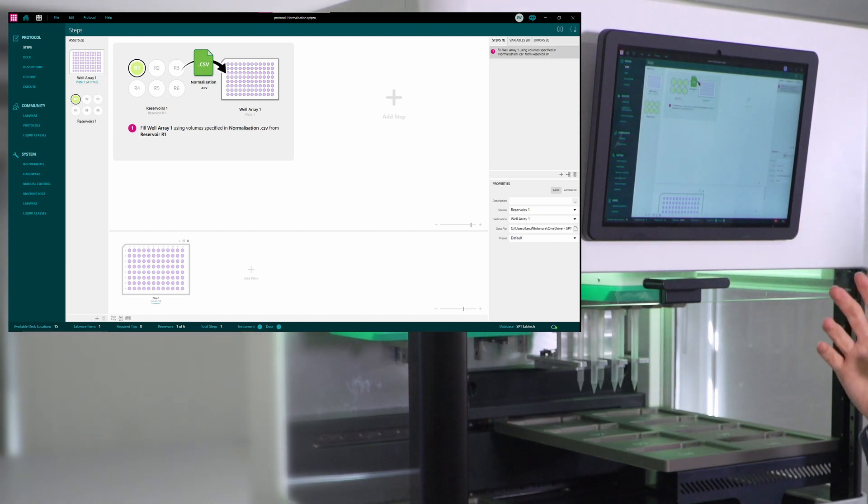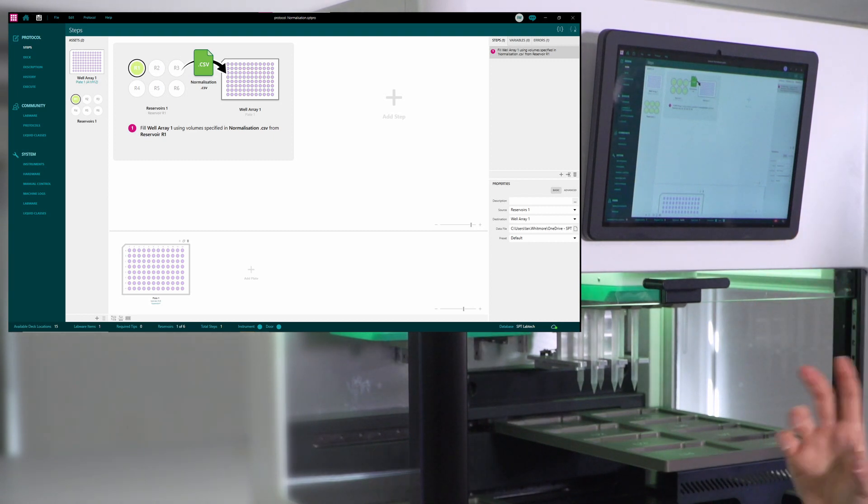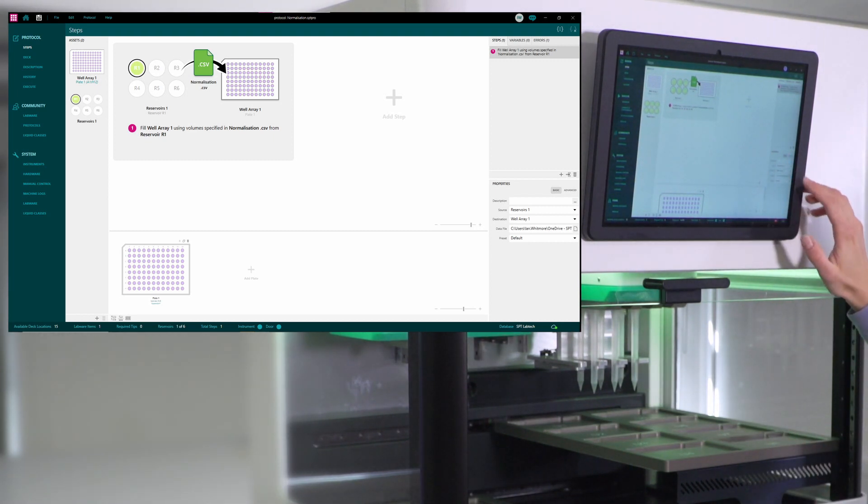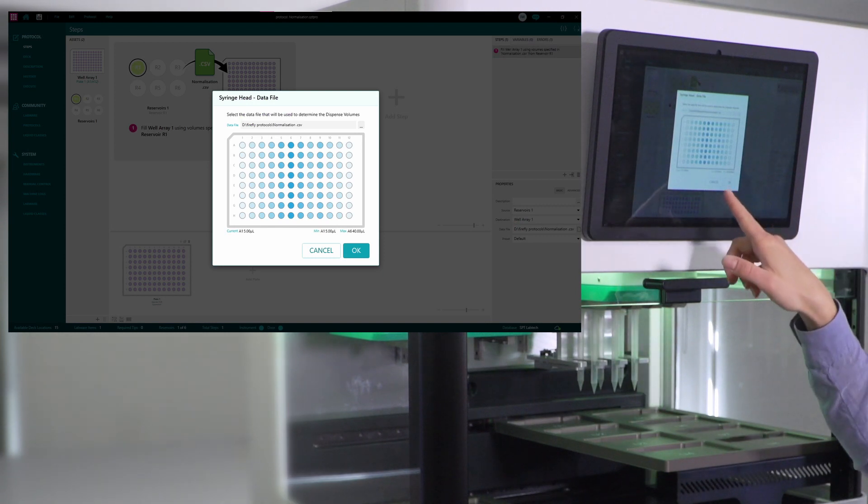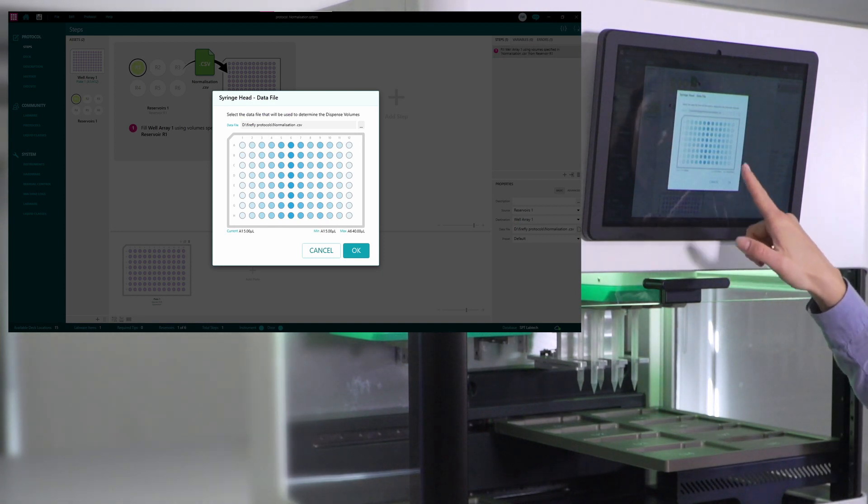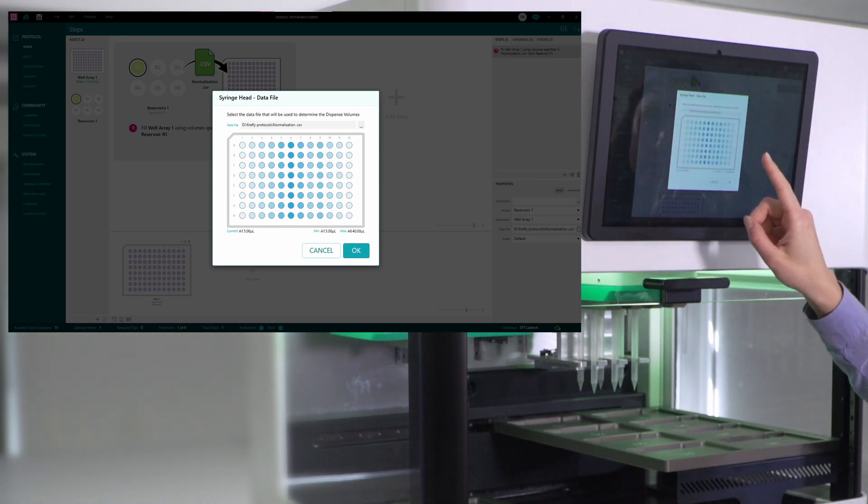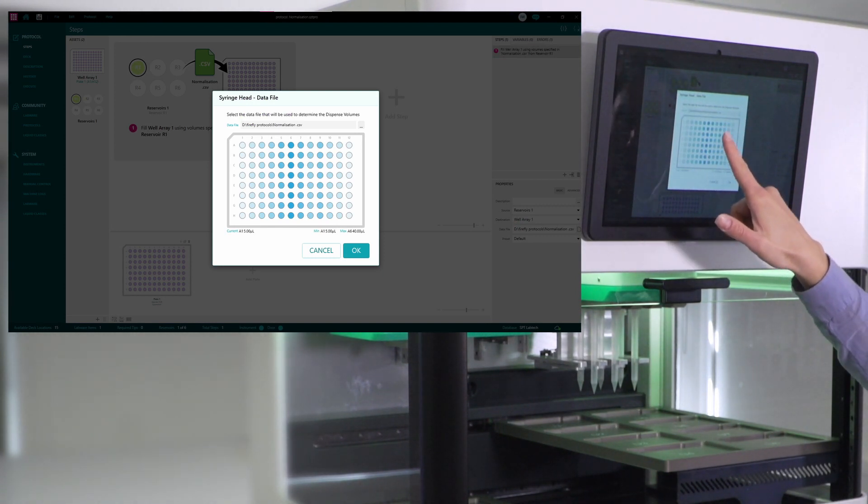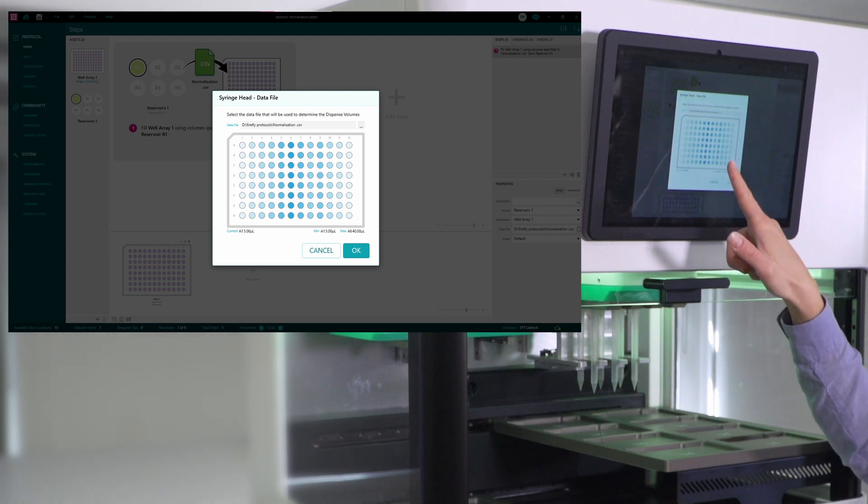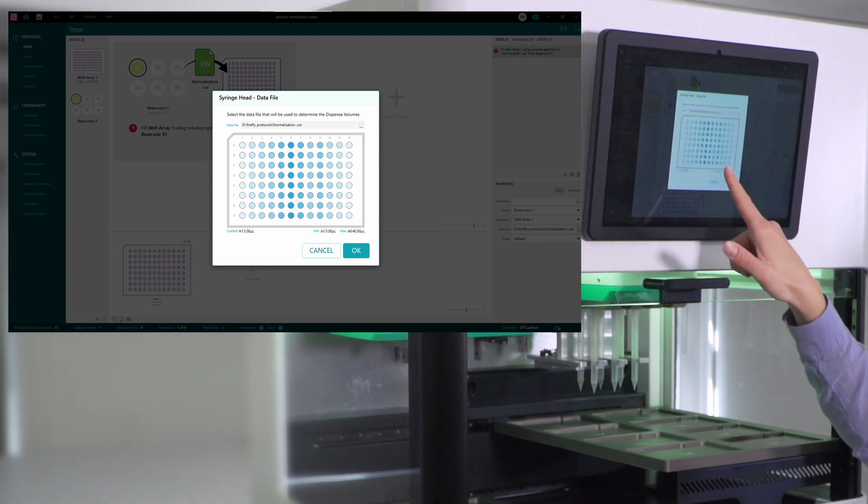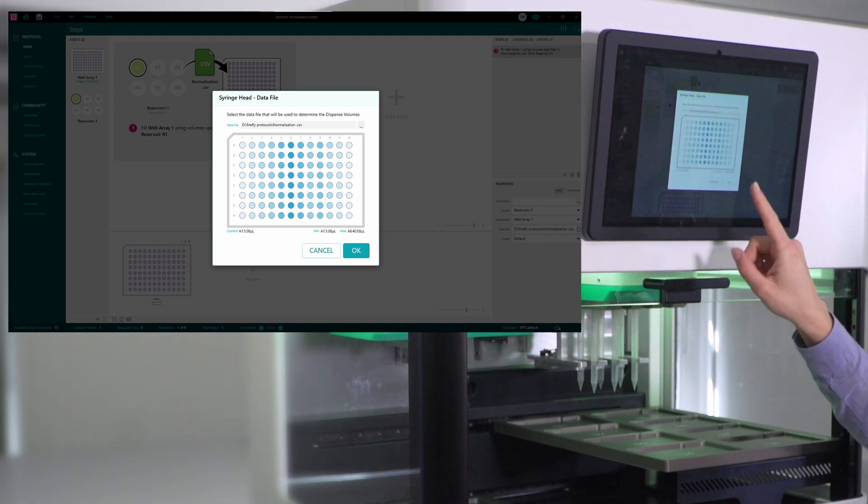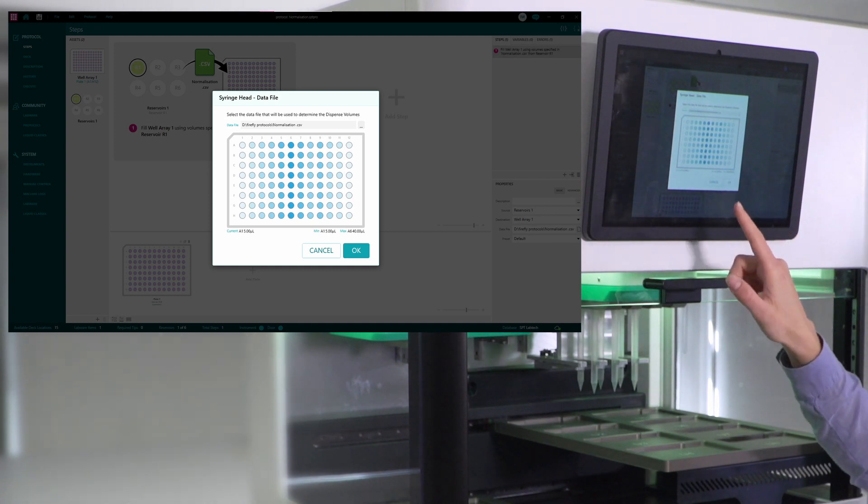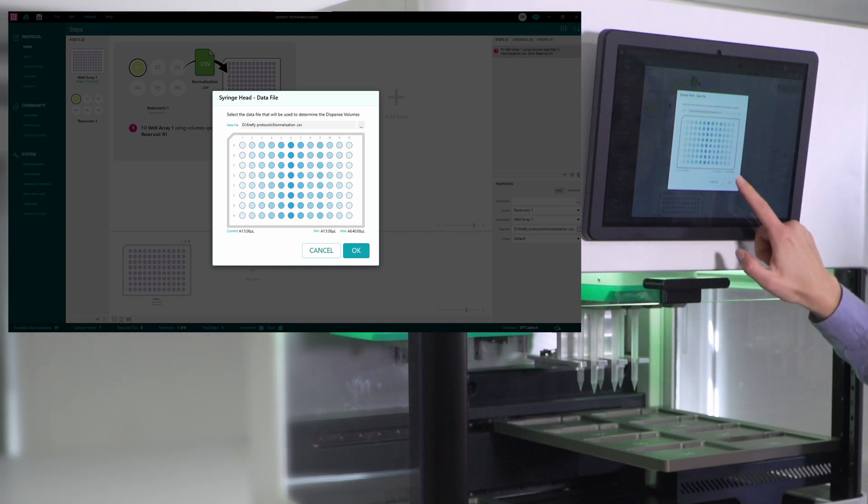And in this file, you can define exactly what volume you want in the well, and then just upload the file like I did here. So here you can see that I have different volumes going into different wells on my plate, and this is highlighted by a different intensity of the color.